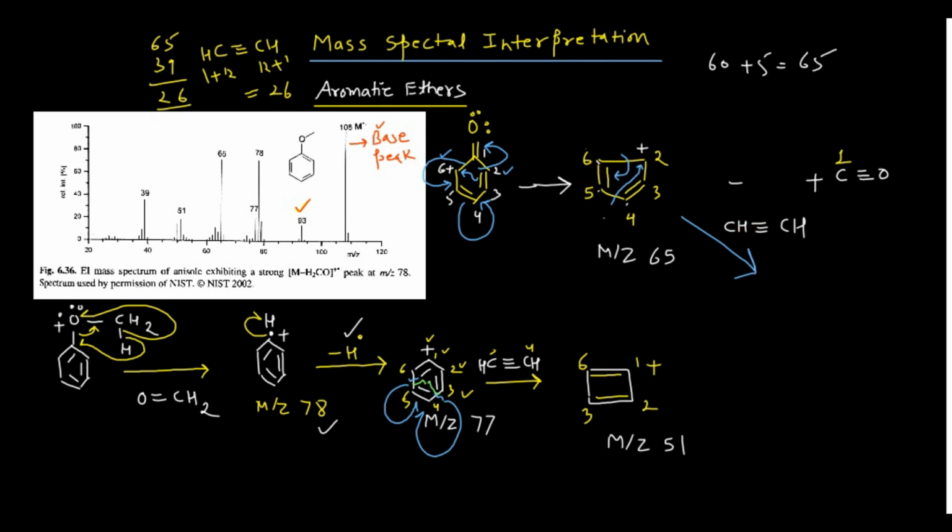So what you can do, you can also observe that when this bond actually breaks, this carbon 4 is basically making a connection with carbon 2. So you will have this particular species, right? Just like that. So you can number it. How can I number them? Say this is your 2, this is your 3, this is your 4. And in between 3 and 4 you are having this particular thing and a positive charge over there.